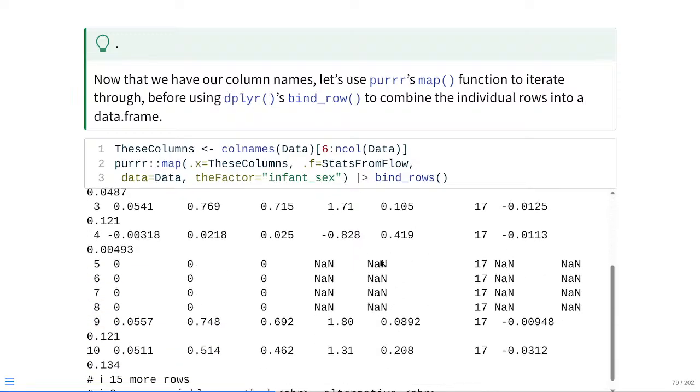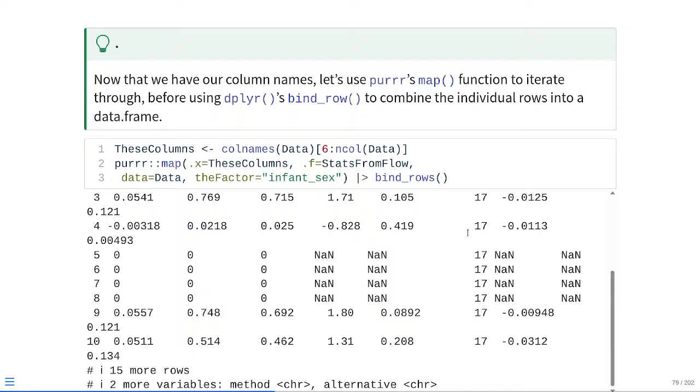You can see for the V delta 2s, where all the data was 0, it's returning NaN, which I had to look up, stands for not a number. So we know it's working accordingly, and then it continues on down the line. So right off the bat, this was relatively quick. It only took a couple milliseconds to do this process.